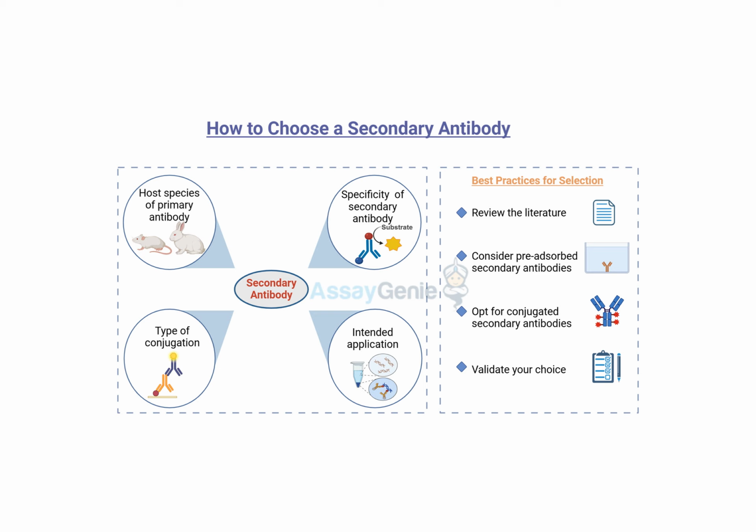Okay, so in vitro. Exactly, in vitro. Gotcha. And then you screen those antibodies against your target. And the ones that bind really well, those are the ones that you select and produce in larger quantities. So it's like an artificial immune system in a test tube. Yeah, that's a great way to think about it. And it completely bypasses using animals, which is great for a lot of reasons.